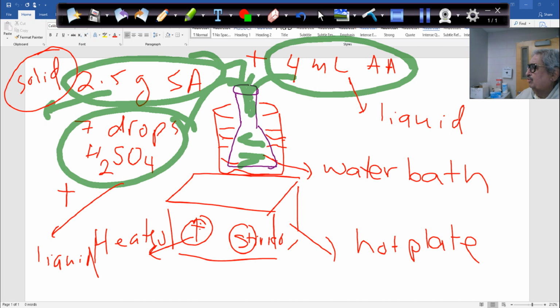But the main thing is you have to have control of the cover, otherwise it will jump all over the place, and you might have to take your digital items out of the bench, to make sure the cover does not come into your digital items.